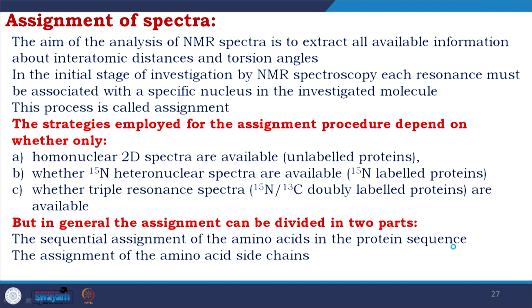So, first we develop the backbone and then we assign the, so that is the first step, and then we want to add the side chains R1, R2, R3 in that.